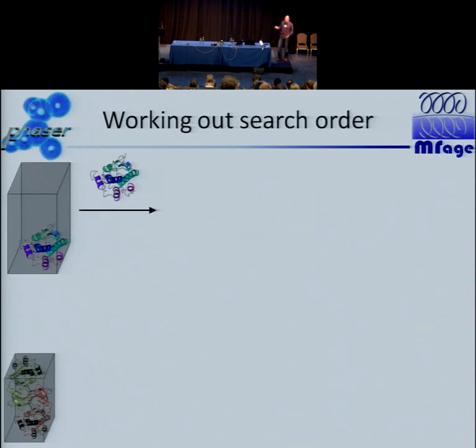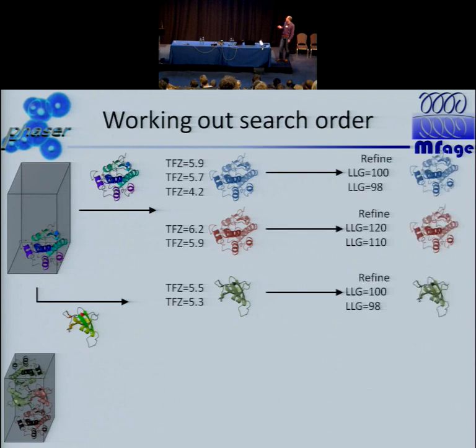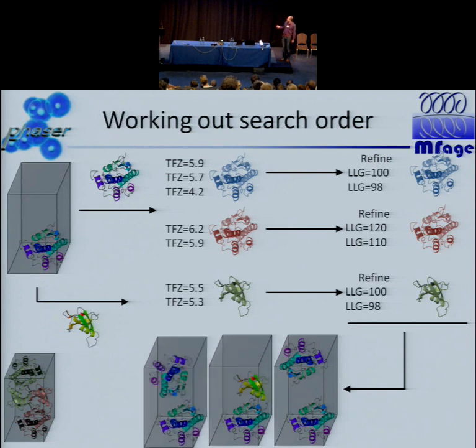So now let's see the other possibility, that we just try the first component and it doesn't work, and we try the second component and it doesn't work either. So in this case, we can just collate all the solutions we have, do some thresholding, do refinements, and then just make up all the solutions we have. And in this case, we possibly have different solutions and also incorrect ones as well. So in this case, we can be maximally, I would say, efficient and also covering all the search space.